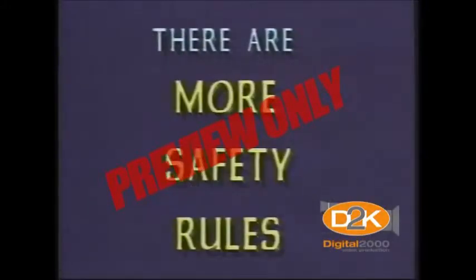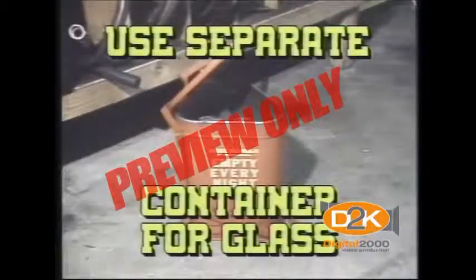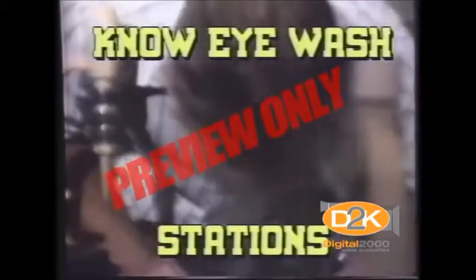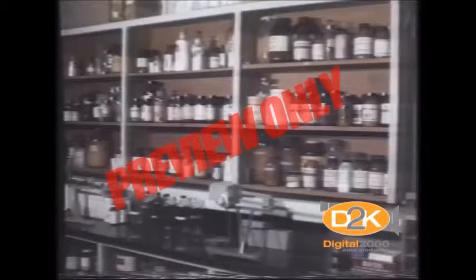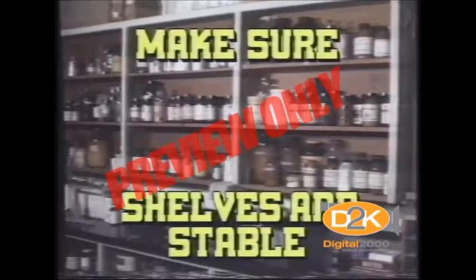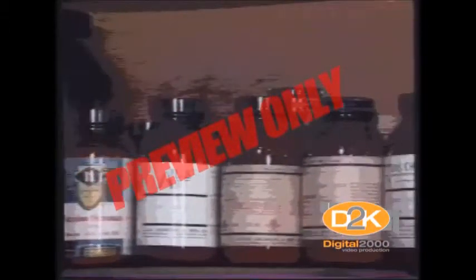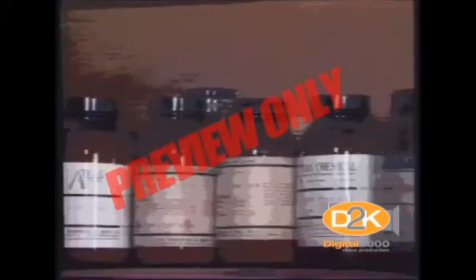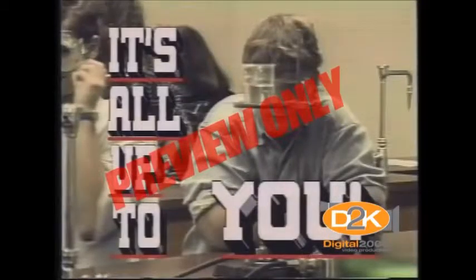Certainly there are more safety rules, such as having separate containers for trash and broken glass, checking eye wash stations frequently, and knowing how to use these eye wash stations, properly securing all gas cylinders when in use, and transporting these cylinders secured on a hand truck, paying particular attention when storing chemicals to make sure the shelves are stable and chemicals are put in their proper place. It all adds up to individual responsibility. You are the only person who can prevent accidents and injuries in school labs.